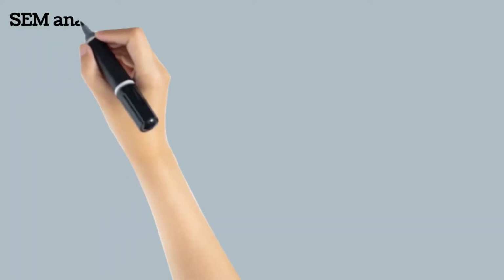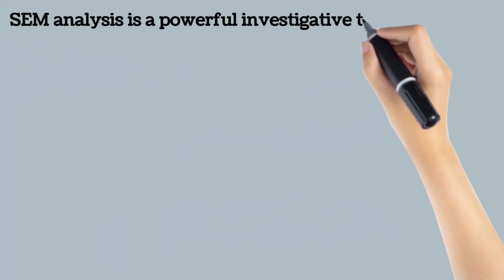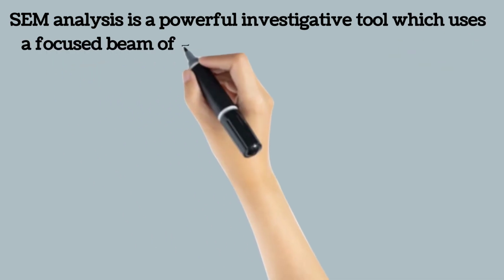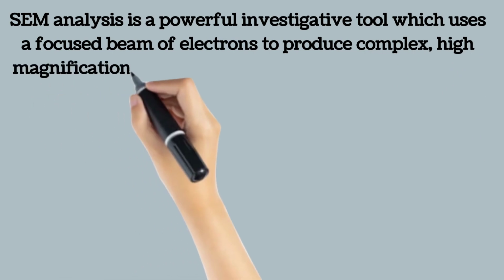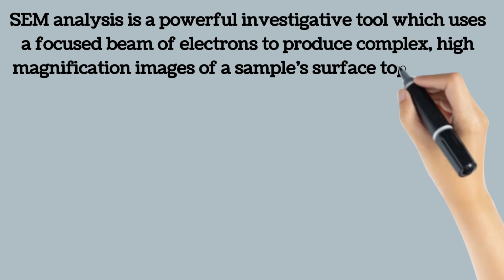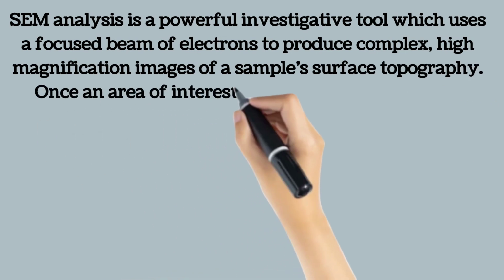Scanning electron microscopy, or SEM analysis, provides high-resolution imaging useful for evaluating various materials for surface fractures, flaws, contaminants or corrosion. Through SEM and EDS analysis, metallurgical experts can provide a thorough examination of material properties and give valuable insights to manufacturers or end users.